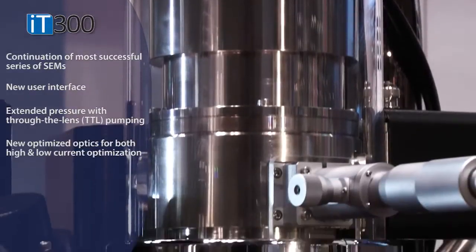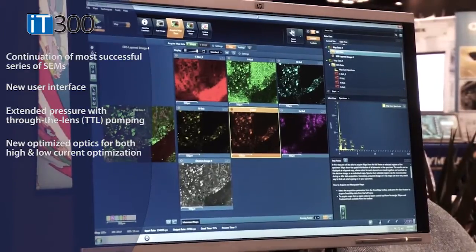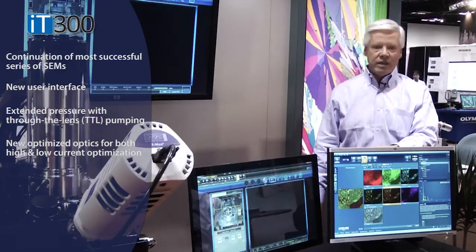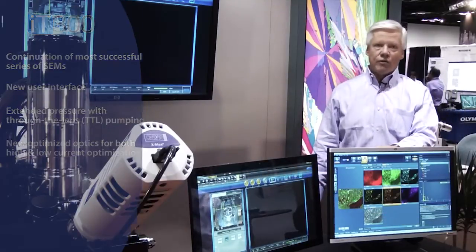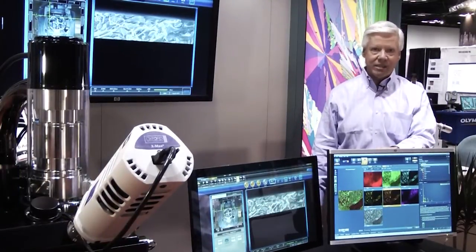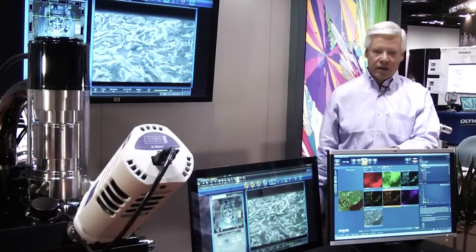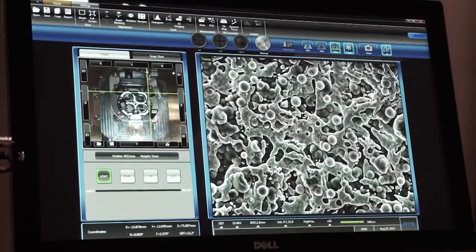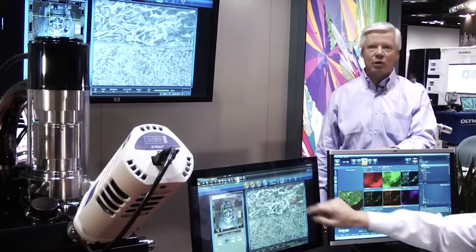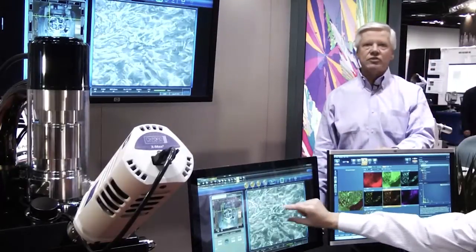We've redesigned the stage, and we've redesigned it to bring it into the 21st century with touch screen operation. As Dave will show, the interface is a fully functional touch screen, although realizing that microscopes are not tablets, we've continued to provide digital knob set with mouse control and keyboard control — it basically allows the user to run the microscope in any mode they feel most comfortable with.